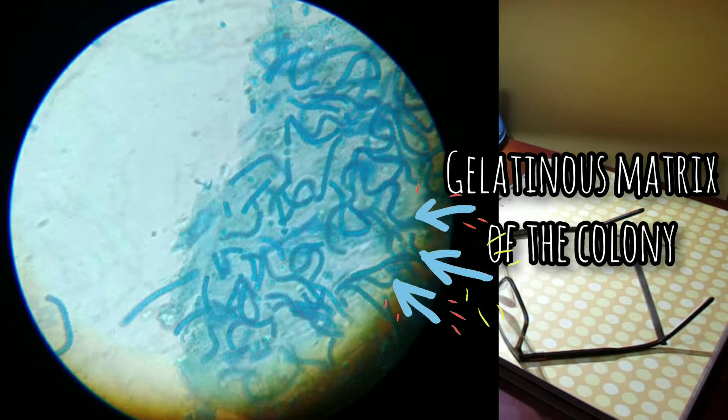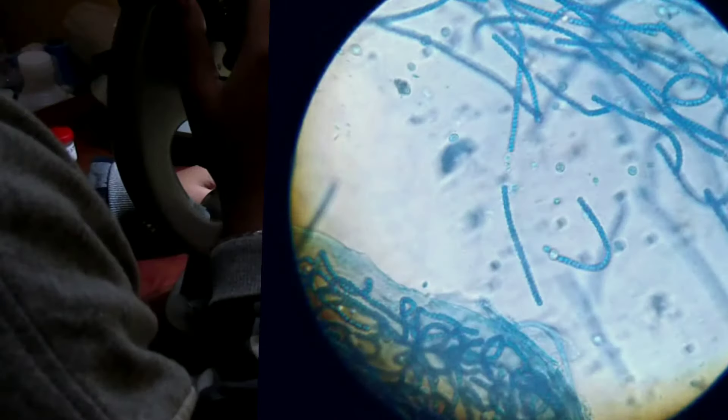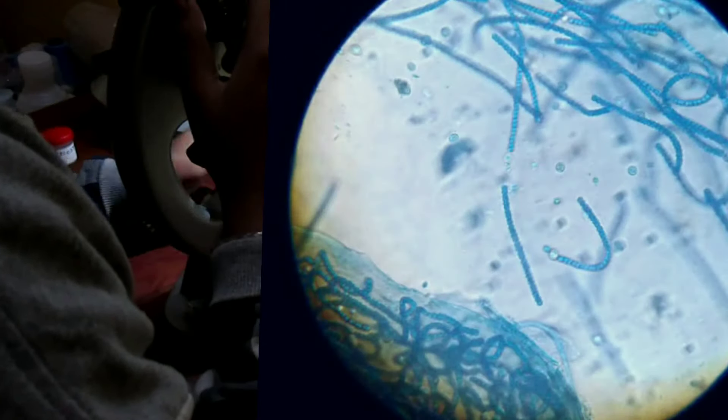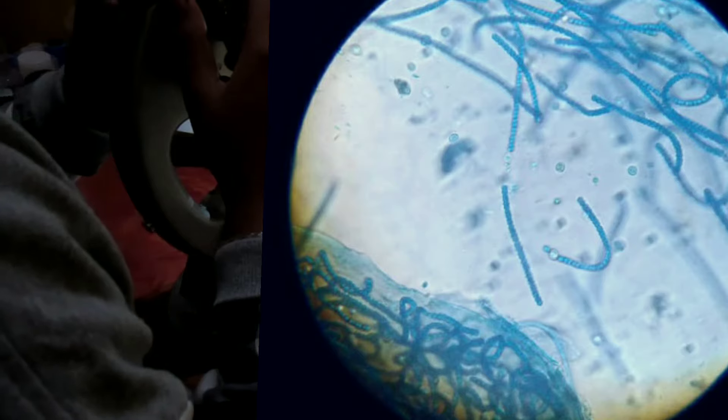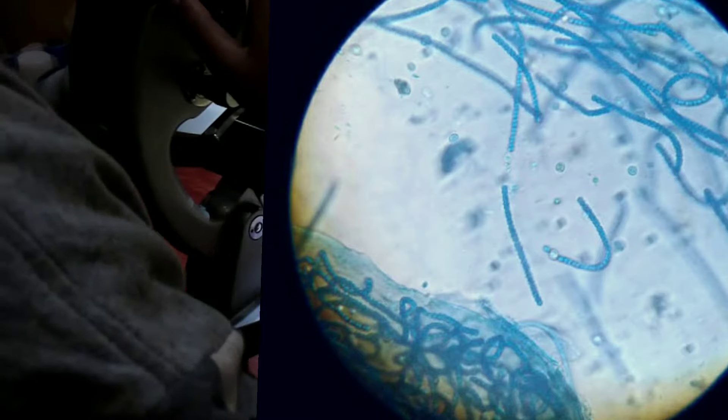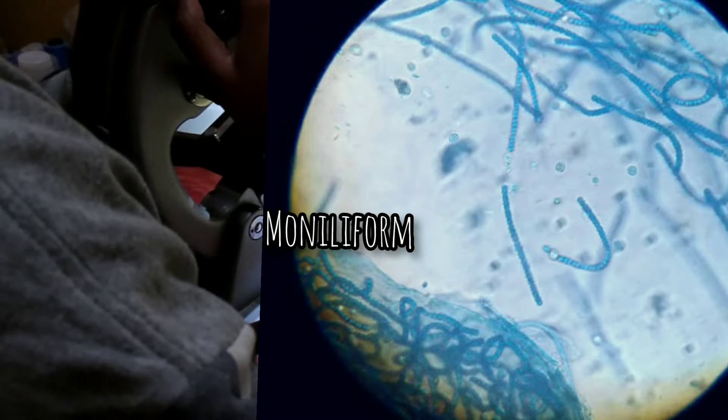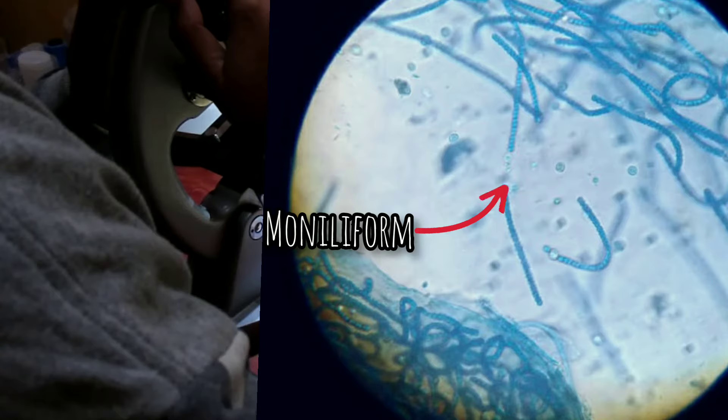The sheaths of adjoining trichomes may fuse to form a common gelatinous matrix of the colony. The filaments are unbranched; they're usually contorted and twisted in various ways. Each filament consists of a row of rounded oval cells which seem to be arranged like beads on a string. Such a habit is called moniliform.